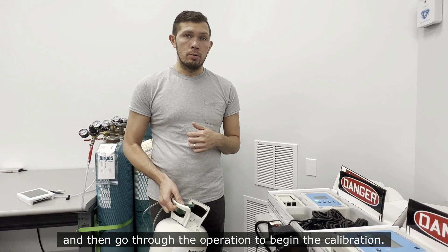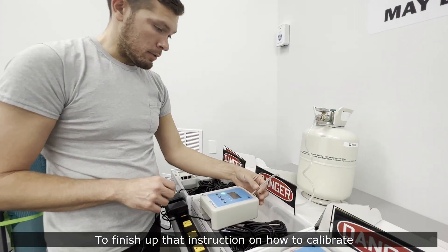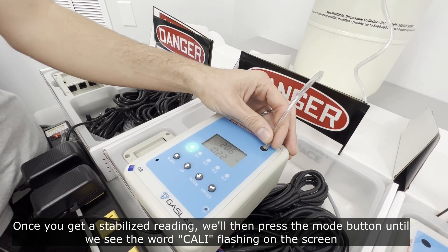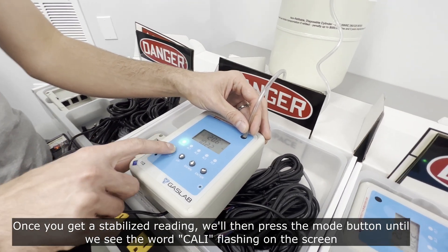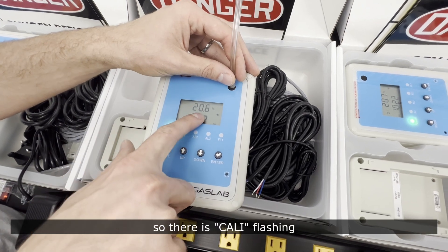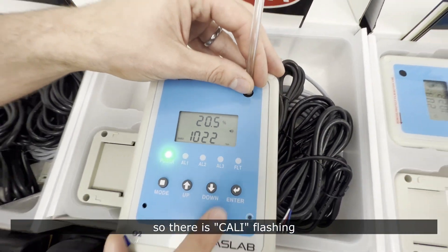To begin calibration, flow your oxygen to the opening vent on the device. Once you get a stabilized reading, press the mode button until you see the word 'CALI' flashing on the screen — and there it is, 'CALI' flashing.